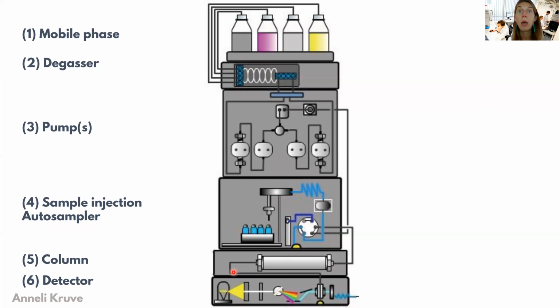The column temperatures can be somewhat below room temperature to elevated temperatures such as 70 degrees or sometimes even more. There are also high temperature chromatographies where even temperatures close to 100 or over 100 degrees can be used. But these are very specialized apparatus, because there even water starts boiling, so it needs to be very, very tight.